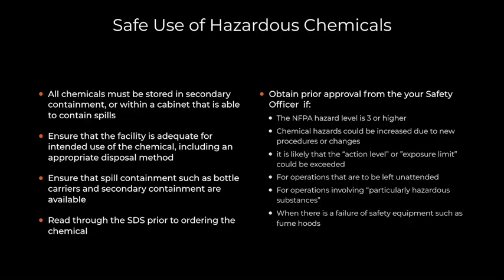Chemical hazards could be increased due to new procedures or changes. It is likely that the action level or exposure limit could be exceeded. For operations that are to be left unattended. For operations involving particularly hazardous substances. When there is a failure of safety equipment such as a fume hood.